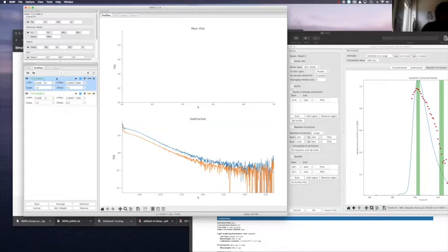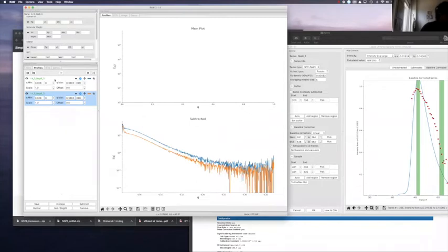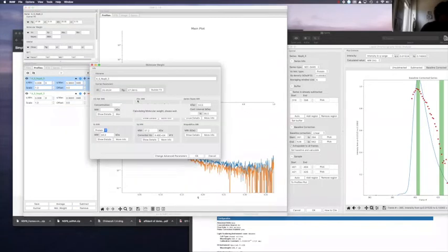You definitely want to calculate the Guinier, and you're getting this information from us anyway, but it's good to redo what the busy beamline scientists do for you. Calculate the Guinier, and using the IPI I mentioned, it will be done automatically, so it will not be so much work. You can do the Guinier for the size of the peak, the shoulder, and I will also definitely calculate the molecular weight. You get the multiple calculators here, and you see the molecular weight is something in between 33 and 37.